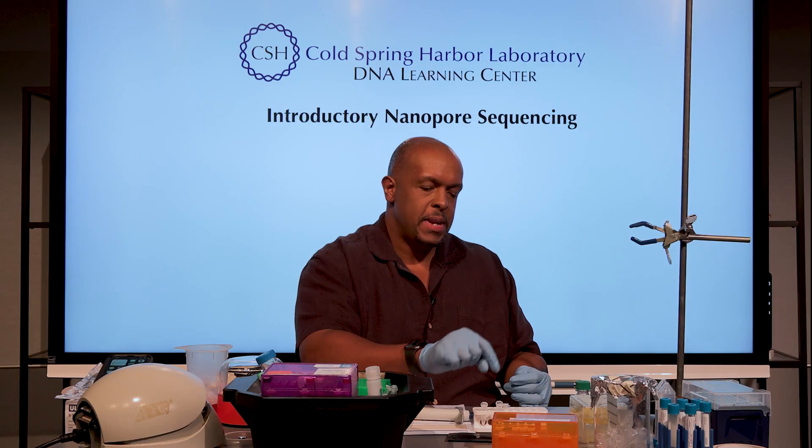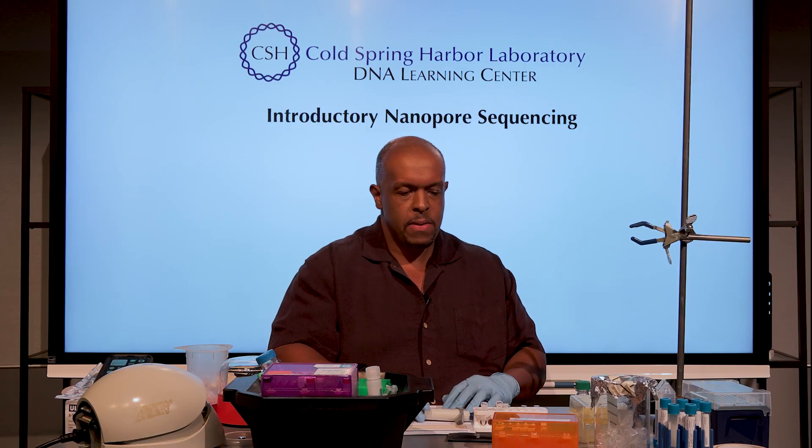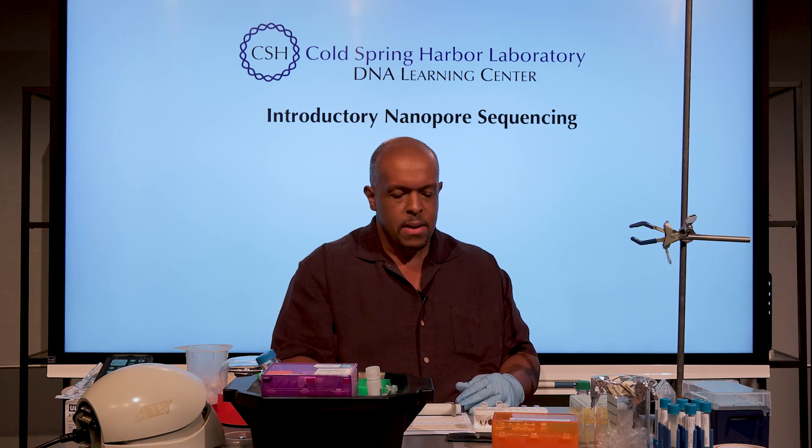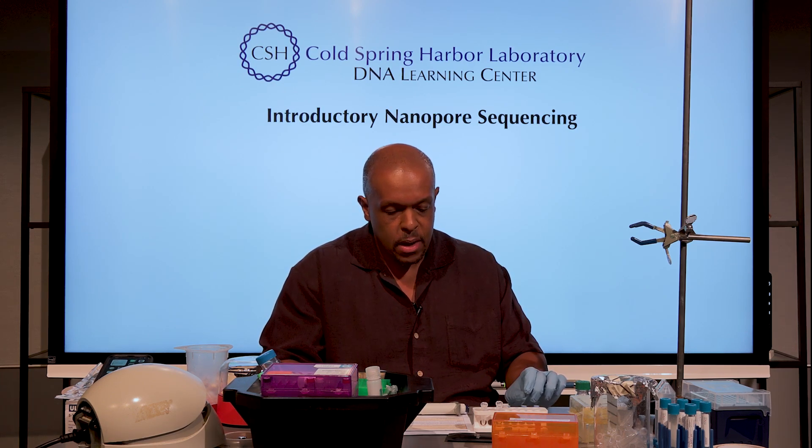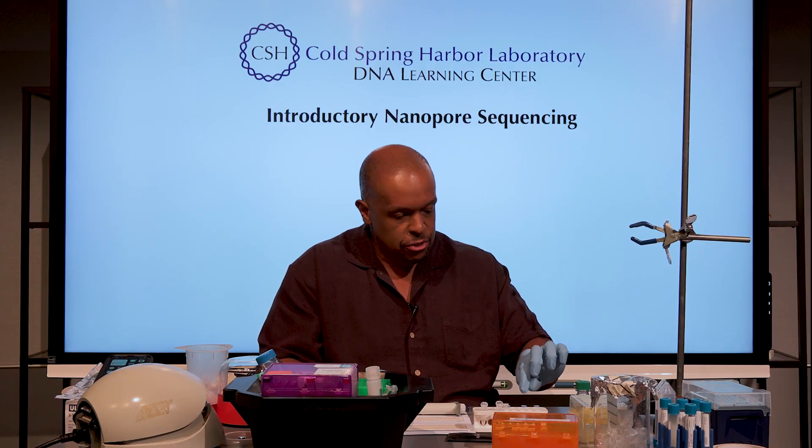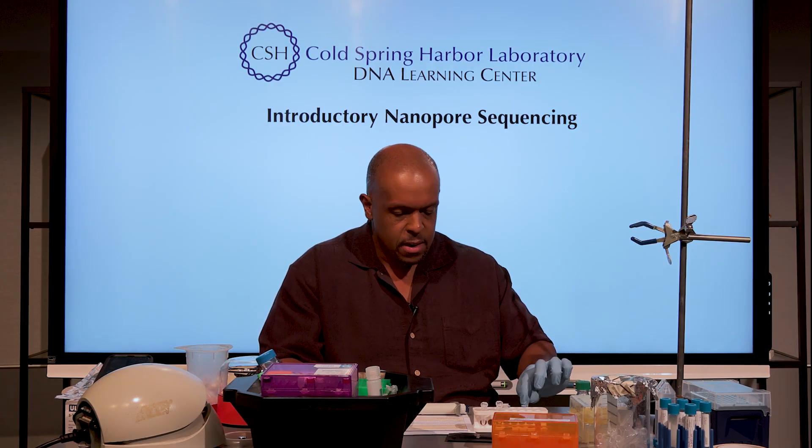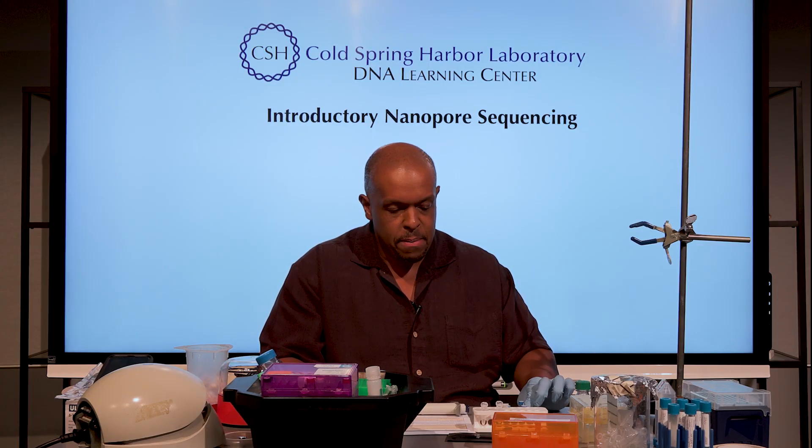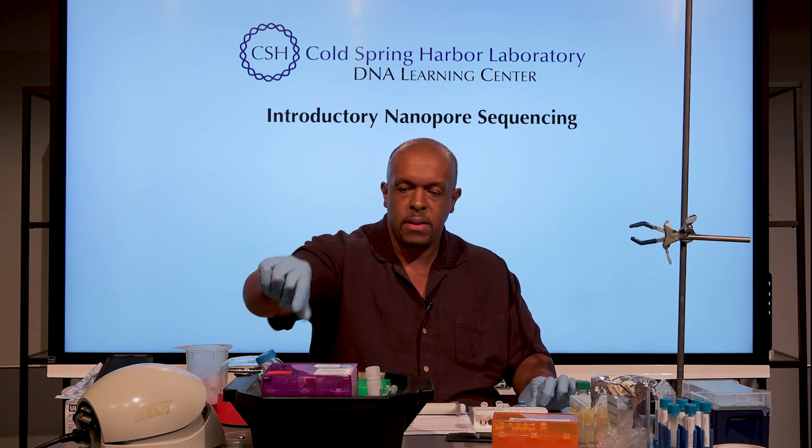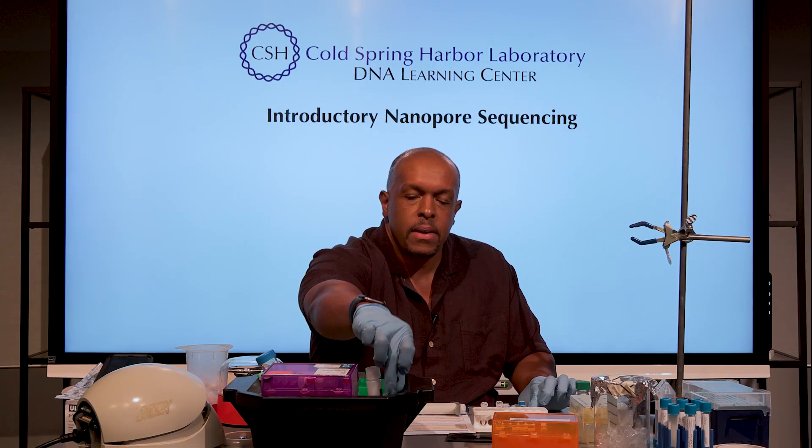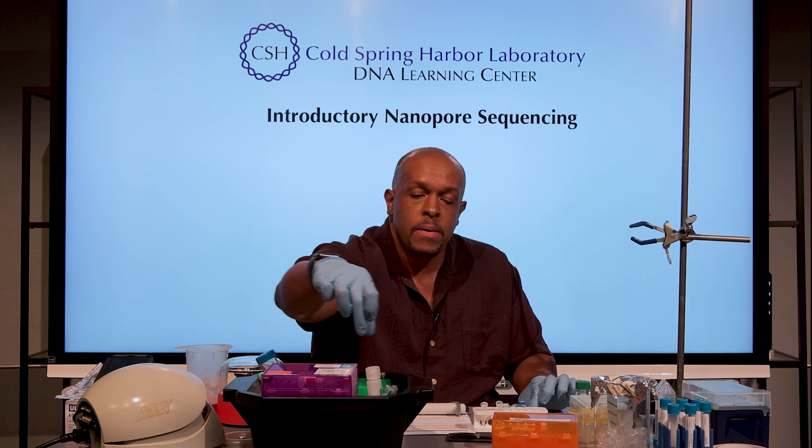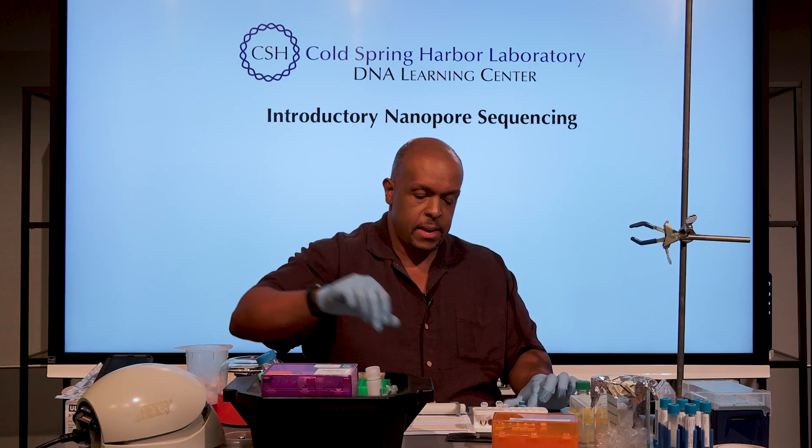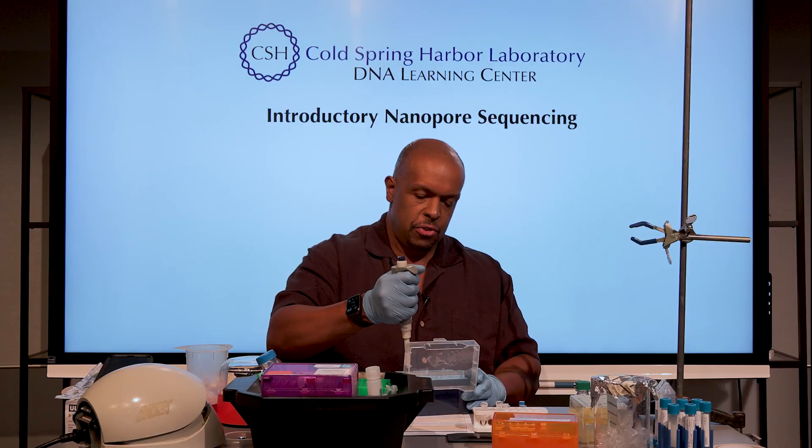I have used the wrong flow cell in the past, so I know that from personal experience. So first we need to prepare and load and flush the flow cell. In order to do that, we need the flow cell flush. You've got this flush buffer here, and we need 3 microliters of the tether, which I've got here. I'm going to get 117 of the flush.